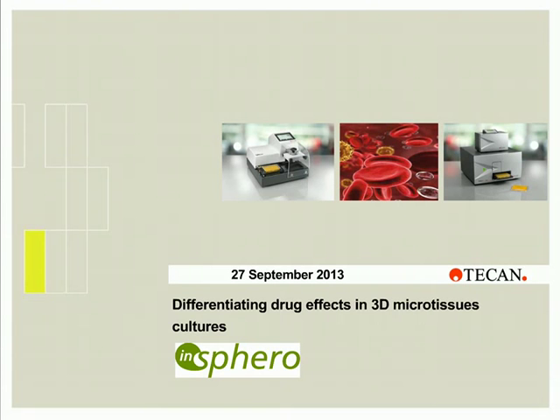Thank you, Christian, for the nice introduction, and I appreciated the very constructive collaboration between Tecan and InSphero over the last 2 years. I think we have generated quite some decent data to help customers to implement the more complex and advanced 3D cell culture model systems into their routine drug discovery processes. I would like to talk a bit about how to differentiate drug effects in 3D microtissue model systems.